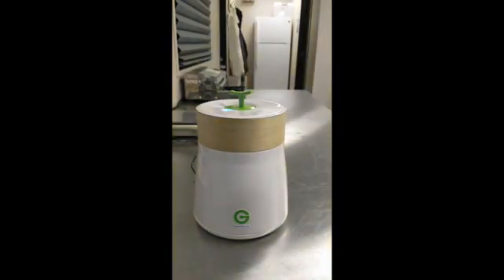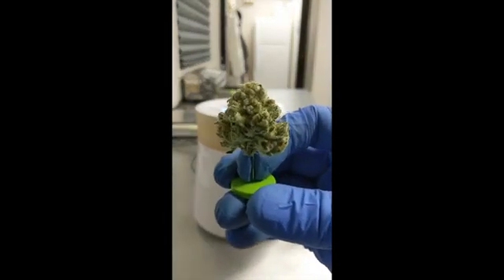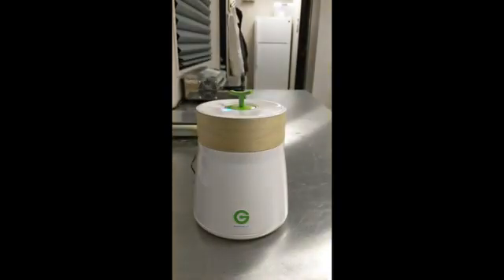The particular flower I'm going to test is a mimosa flower. This is something we grew for the California recreational market, and I already have an official California COA test on this flower. That's one of the reasons I'm testing this one — to show exactly how close this Gemisert is to the official lab test from the state.